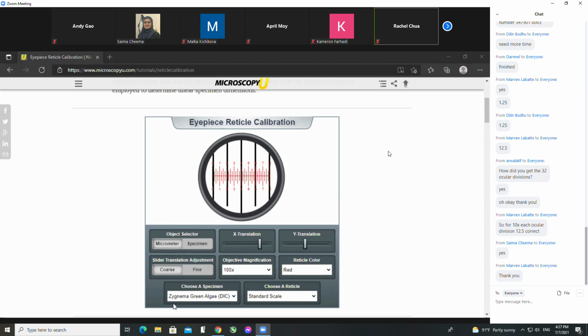That's just what we call it because the microscopic units are micrometers, a millionth of a meter. Because we're seeing it using a microscope, and also because the units on it are in micrometers, 10 micrometers, right? That's why it's called a micrometer ruler. Oh, okay. It's just the name of the ruler too. Okay, because I keep thinking why we still need to count for the micrometer. Yeah, and no. That's already there.